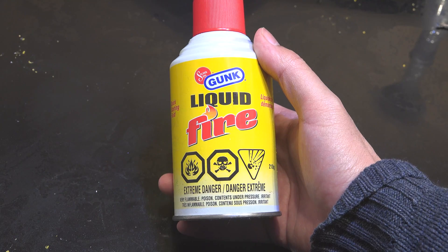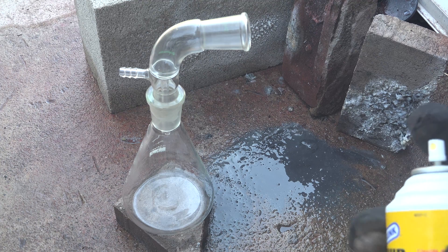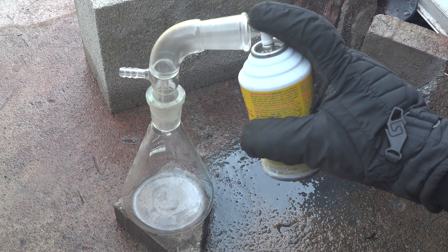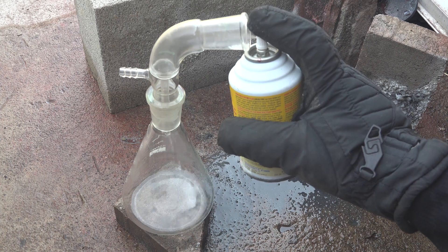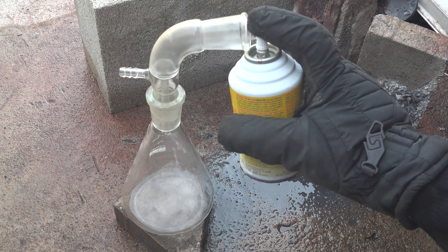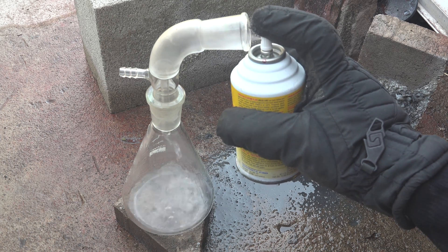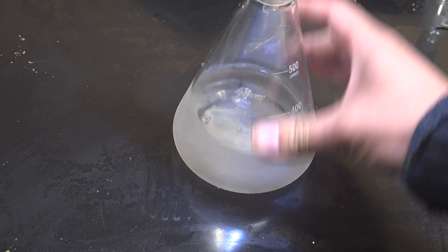Now to separate out the ether we're going to distill it. First, spray the contents into a flask. Mine didn't come with a spray straw so I'm using a distillation adapter to direct the spray into the flask. This is completely optional though — I'm just using it because it lets me hold the can upright. I'm wearing a glove because the can was previously cooled in a freezer overnight to lower the temperature. This is to help reduce evaporative losses. Nonetheless some will escape, so do this outside or in a fume hood.